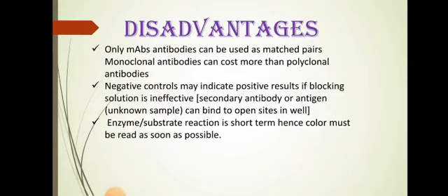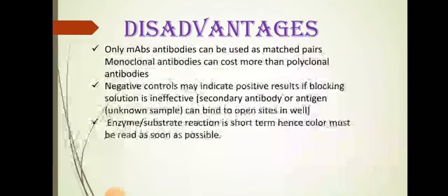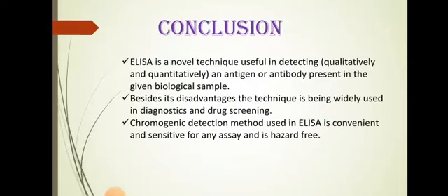Disadvantages of this technique: only monoclonal antibodies are used in the technique. Negative control may indicate positive results. The enzyme substrate reaction is short term, hence the color must be read as soon as possible.